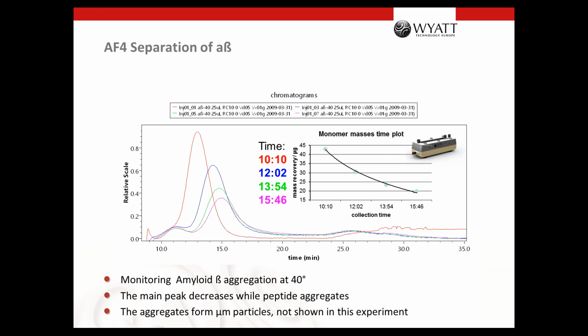In case you want to, for example, measure lake water where the concentration of the particles is very, very low, then you could still use a manual injection loop where you can inject 10 milliliters, for example, or even more if you want. But then the focus inject time would be maybe 10 minutes or 20 minutes instead of just 2 minutes when you inject 10 microliters. So you are very flexible with this focusing. That's totally different than in SEC.